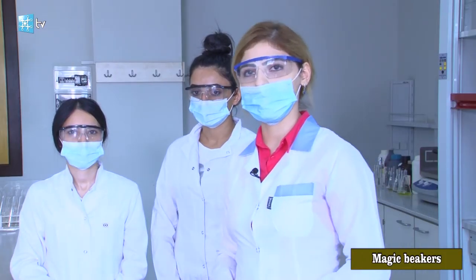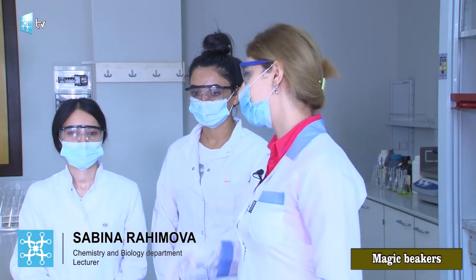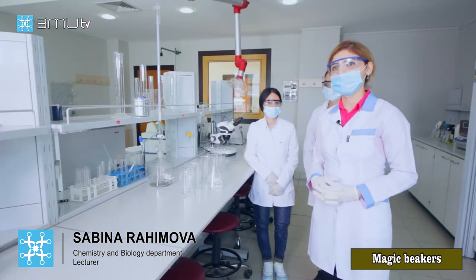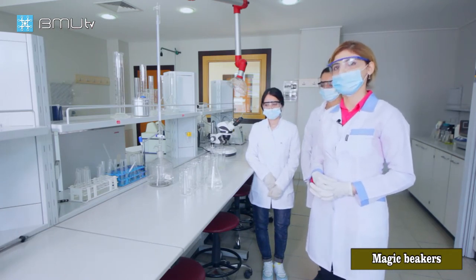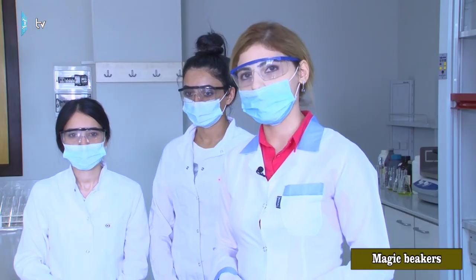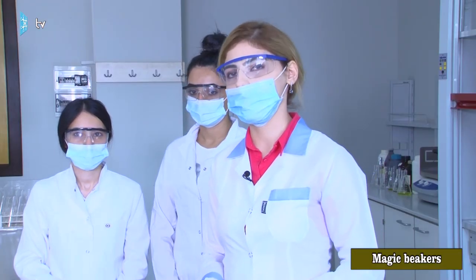Hello, I am Sabina Rahimova, chemistry lecturer, and our students Basta Ava Malieva and Shafak Aslanova. Today we are going to demonstrate the magic beakers experiment, which is related to complex compounds, acids and bases, transition metal chemistry, and the evidences of chemical reactions.